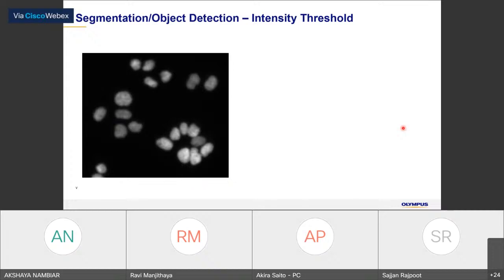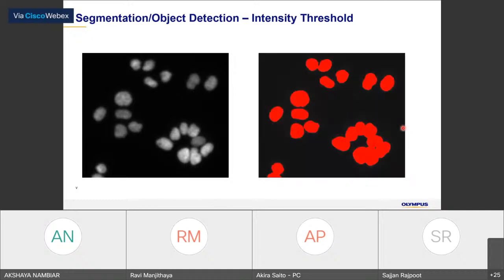So today's topic is about the segmentation of the object. For example, you got this kind of nuclear image. This is just the image with DAPI staining. And you can see that there are a couple of nuclei in the image. The easiest segmentation is to use the intensity information. I mean, give a threshold so that everything above some intensity will be detected. For example, you can just do the intensity thresholding and detect these areas.